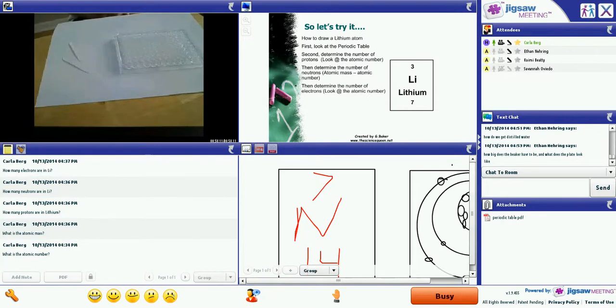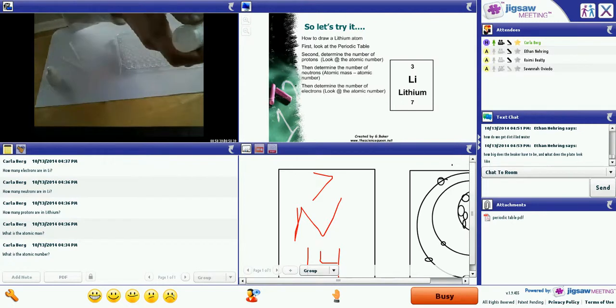Once you have step 1 done, you are going to find your potassium iodide. It is a clear bottle. You are going to shake it up nice. And follow step 2, adding the drops appropriately. You are adding 5 drops to well A1.